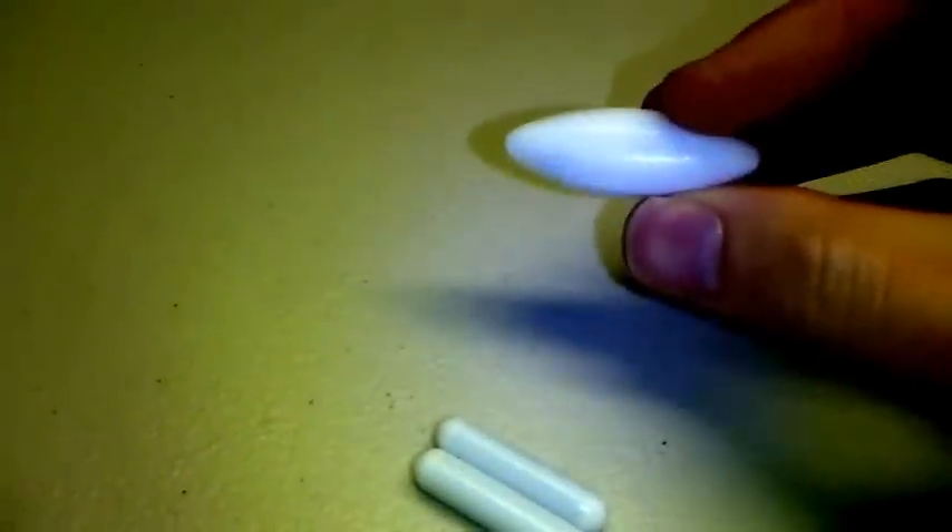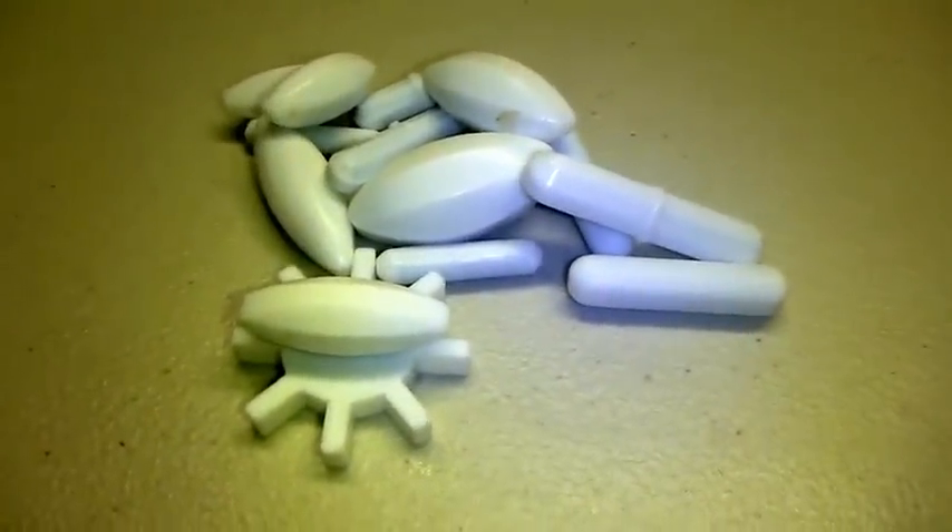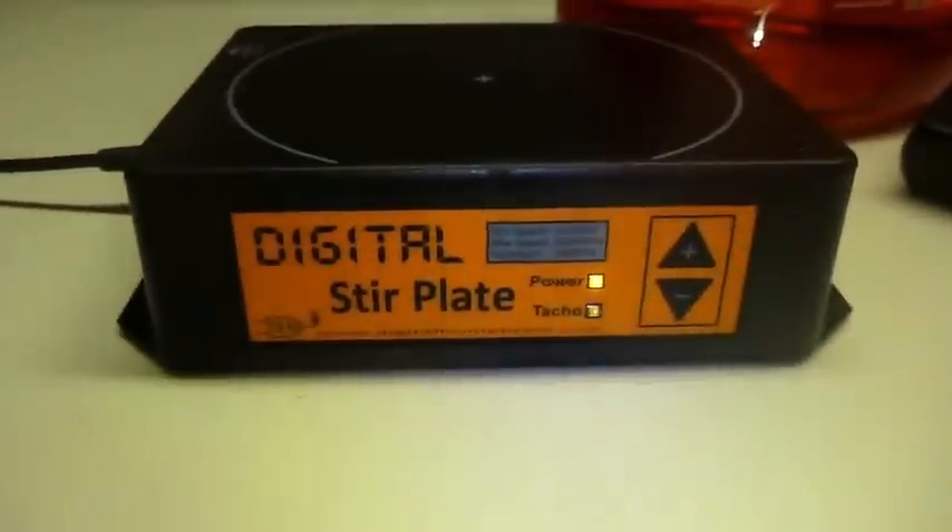Another thing that we've changed in this batch is the stir bar. There was a lot of talk on the forums about which stir bars we'd end up going with. We trialled out some of the 40mm oval bars and they were pretty good, but in this batch we actually ended up going with a 30x7mm, which is 1mm thicker than our original 30x6mm bars from the last batch. We've tested all of these stir bars quite extensively and it turns out the 30x7s were the best ones out of the whole batch. We'll make some videos later on to show how the other stir bars fared, but we're pretty happy with how these perform — that's what's being shipped this time.